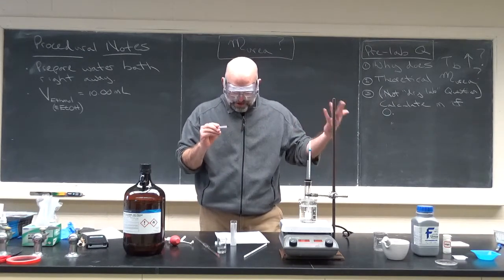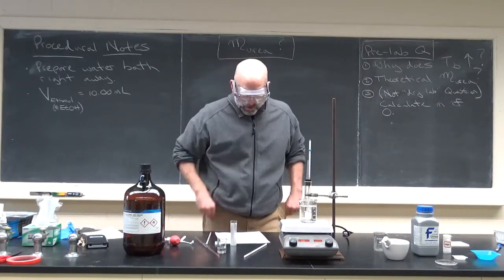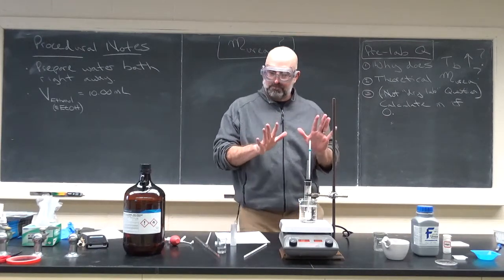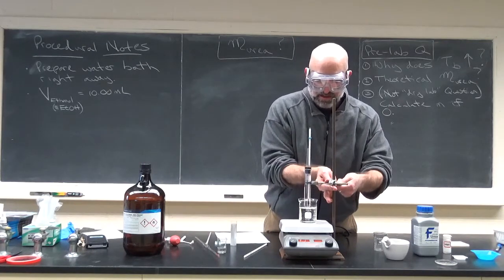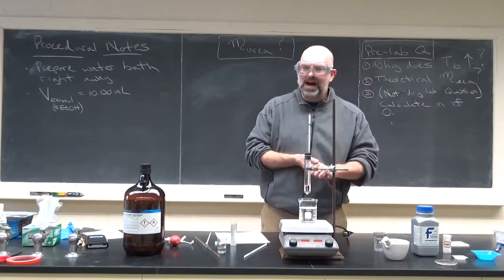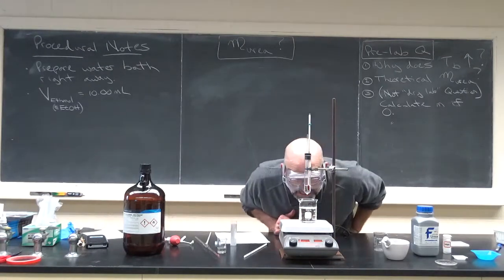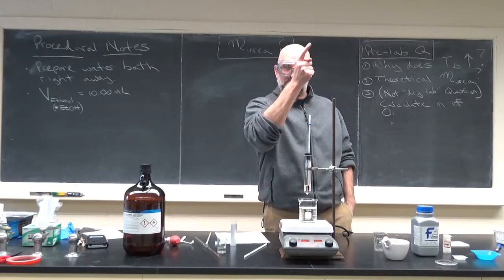When a steady stream of bubbles escapes from the open end, down at the bottom of the test tube, remove the apparatus. This is key. When you see that steady stream, you take the clamp and remove the apparatus. Why do you do that? Then you're going to watch very carefully. Watch the capillary tube, and you'll see ethanol go up into the capillary tube.